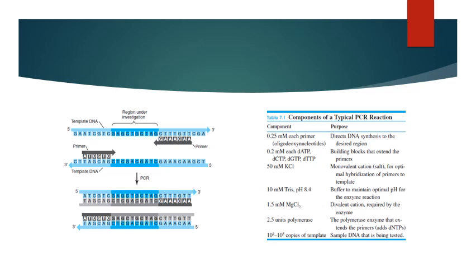So all isolation cabinets, all PCR cabinets and equipment are equipped with UV light sources that should be turned on for about 20 minutes after the box has been used. That allows any residual DNA to be damaged so that it cannot contaminate your next run.